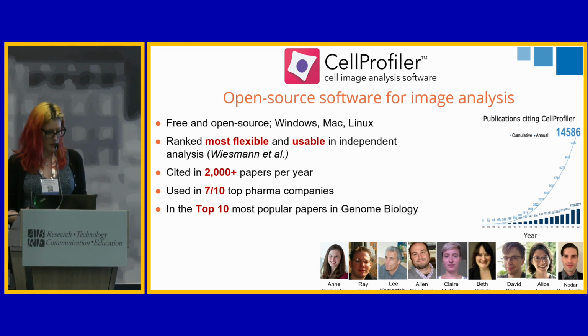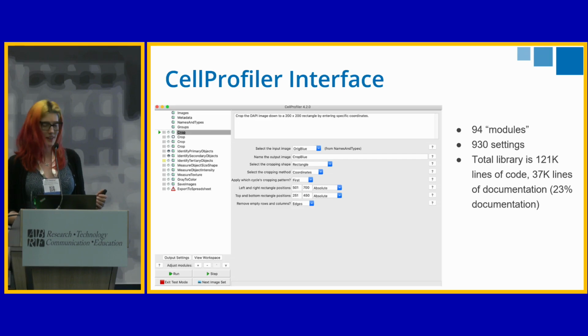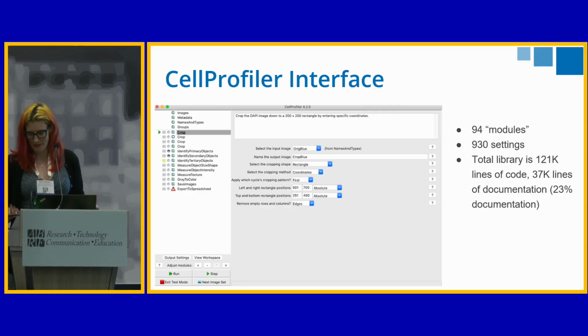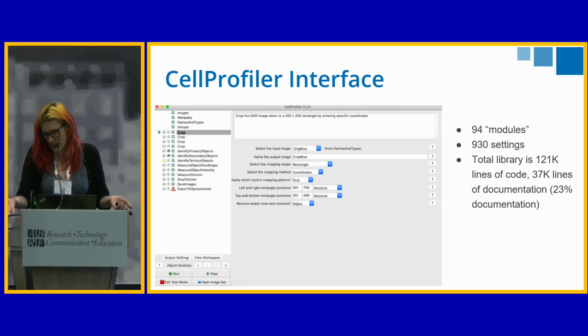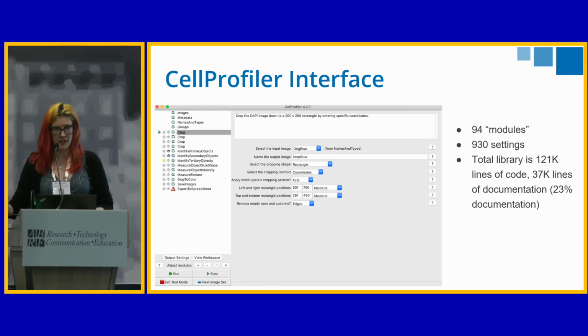So it has a simple interface that, unfortunately, I don't have the time to go into great depth on, because it says 15 minutes now. I don't actually get the full time to really convince you about how awesome it is, but you have a simple GUI where along the side here, you can drag and drop in modules, and every module has its own set of settings that you can tune.